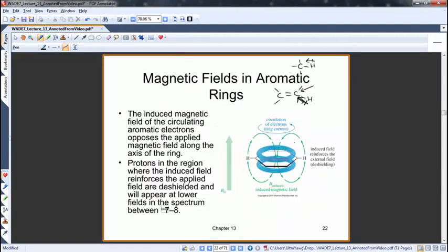All right, so if I had an aromatic ring, a benzene ring, and I'm talking about the hydrogens that are bonded to the ring, well, as soon as I put a magnetic field on electrons, especially electrons that are in a pi system, they start to circulate, and they start to go around in a circle. If you took physics, you know about the right-hand rule and all that, electromagnetic field lines and things like that. I don't care about that stuff. The take-home message here is that pi systems, whether it's a carbon-oxygen double bond, a carbon-nitrogen double bond, a carbon-carbon double bond, or a benzene ring or similar, or a series of pi systems, something like this.